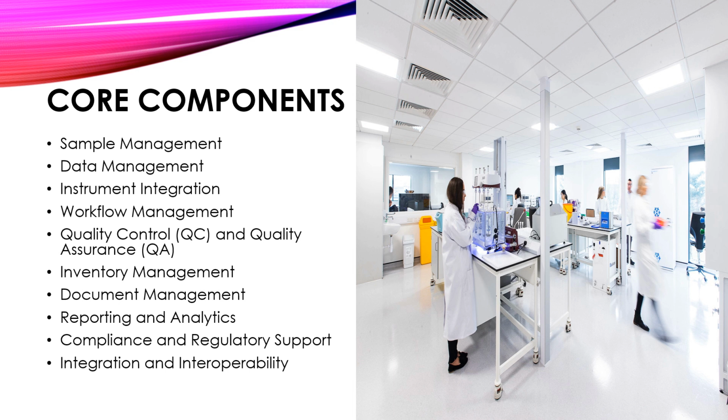Document management. A laboratory management system manages laboratory-related documents, including protocols, SOPs, test methods, reports, and regulatory documents. It facilitates document version control, access control, and electronic signature capabilities to ensure compliance with regulatory requirements.